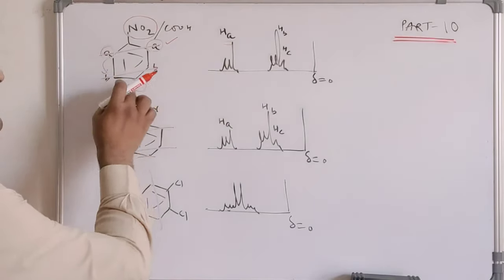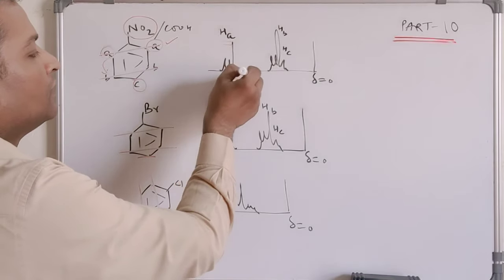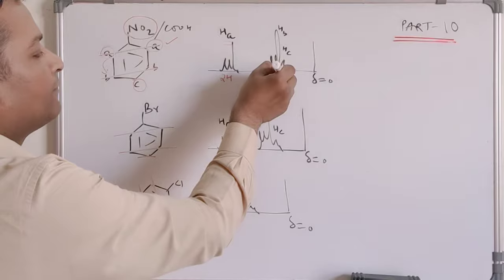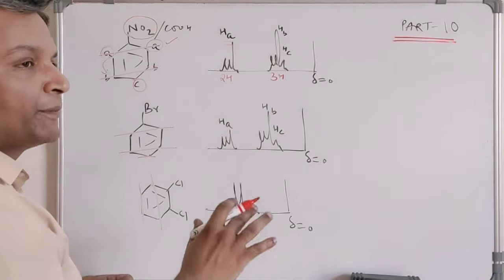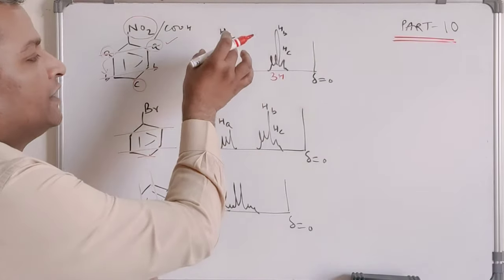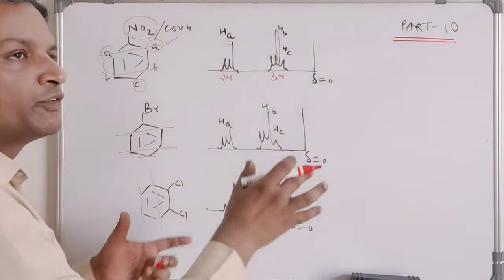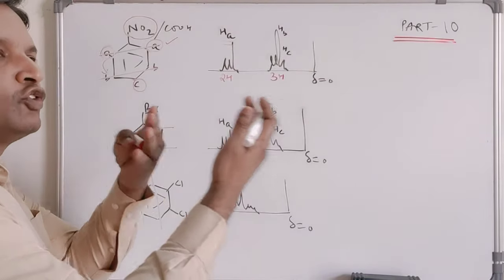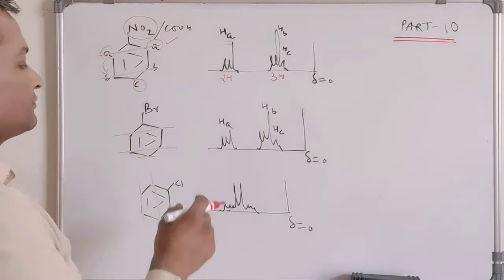Then we observe the HB and HC pattern. So we observe a pattern of 2 protons, then we have a peak for 3 protons. It is a complex pattern; we cannot make out the nature of the peak. We cannot easily define whether it is a singlet, doublet, or triplet, because they are so overlapping and so complex. We just see them as a bunch of peaks.